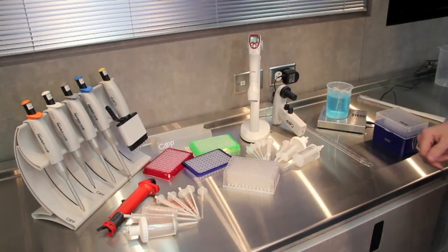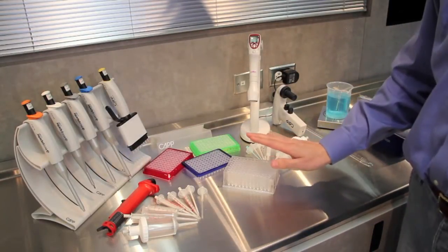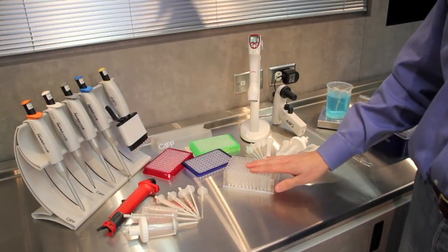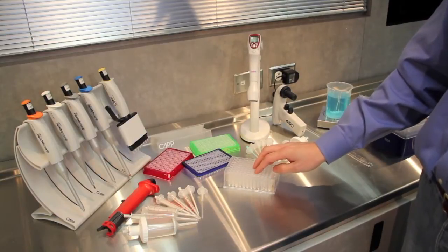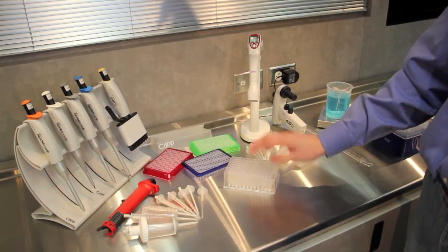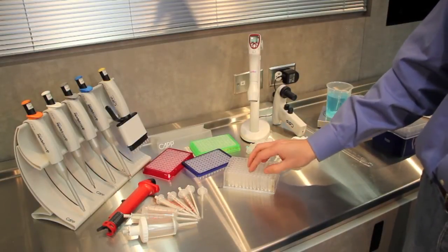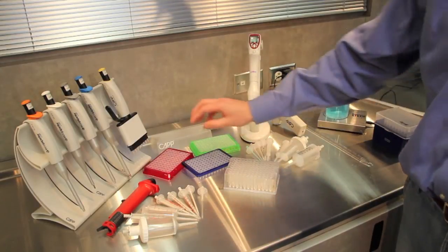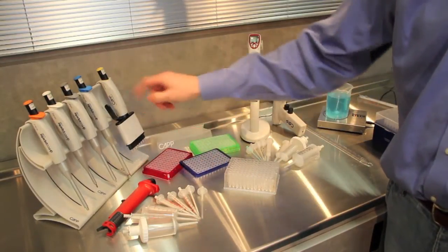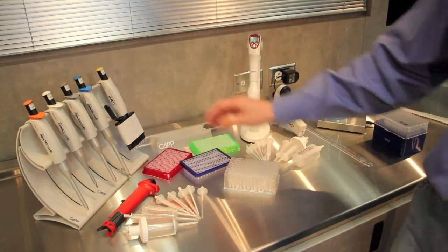Hello, in this video we're going to be looking at a couple different options for filling up a 1ml deep well 96-well plate. We're going to go through four different ways you can accomplish that task. We're using a deep well plate and not a shallow plate where we could use a multi-channel pipette, so we're dispensing 1ml into each one of the wells using a variety of different tools.